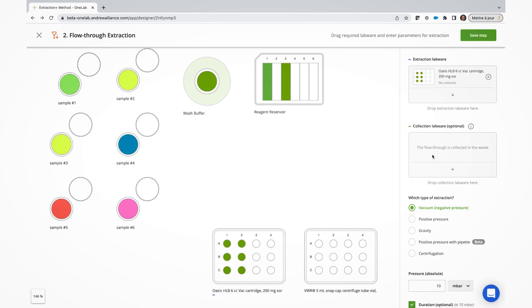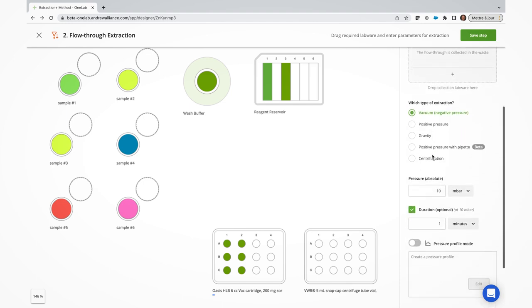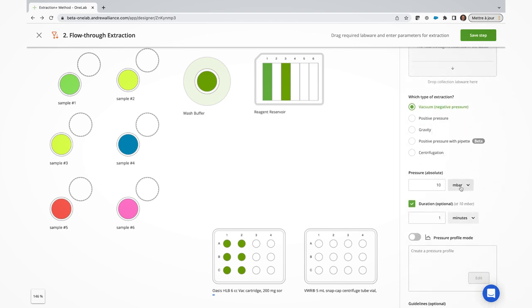The vacuum extraction setting is selected by default, so you can directly scroll down to specify the desired pressure setting and then the duration. The pressure profile mode can be activated here.